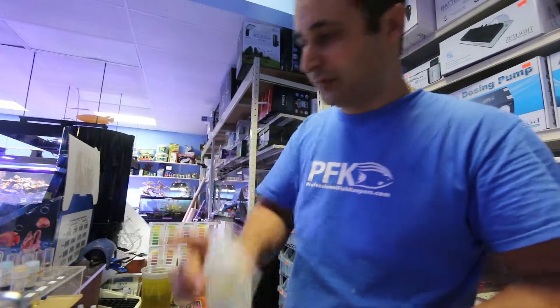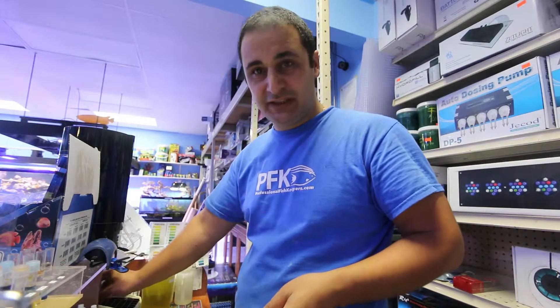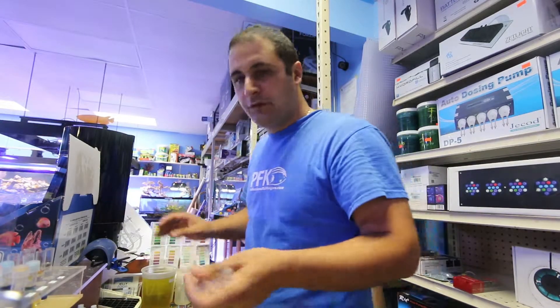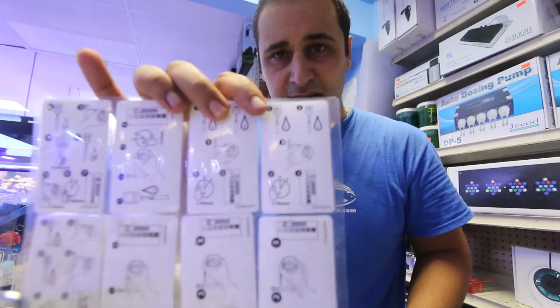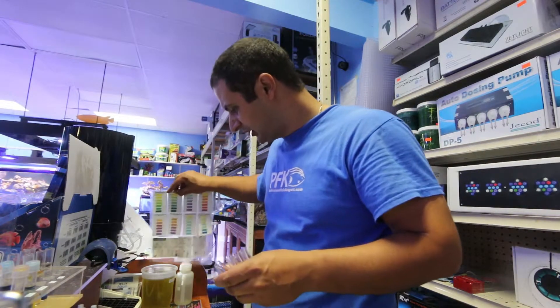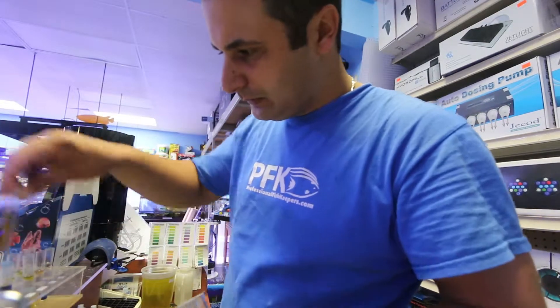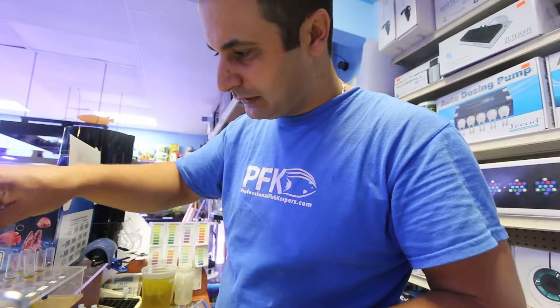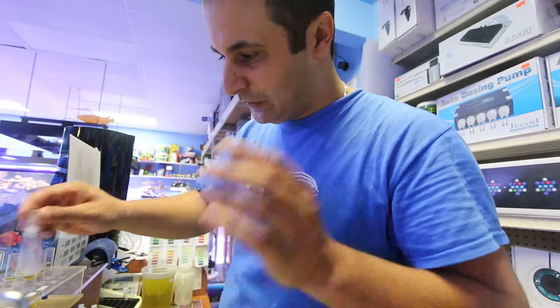Let me show you how to test for four parameters: pH, ammonia, nitrite, and nitrate. I'll get a water sample. There's a little book that comes with the test kits explaining parameters and how to fix problems. The kit also includes color charts — one smaller and one larger — that you compare your results against.